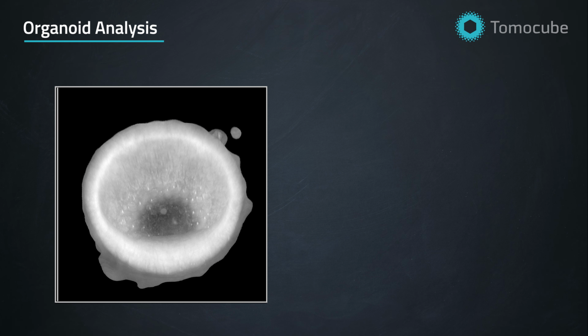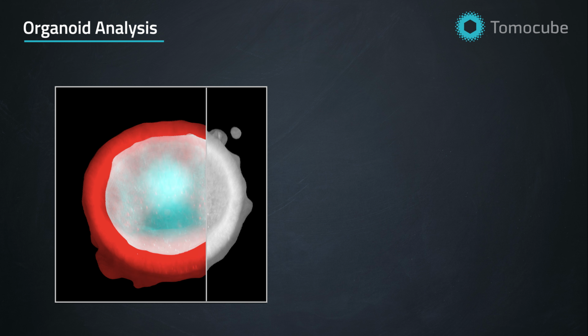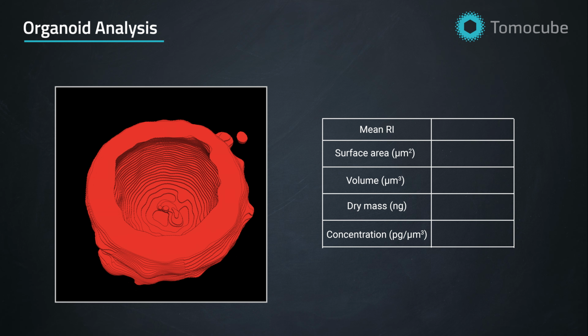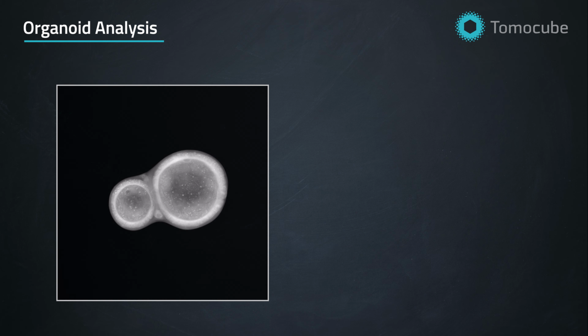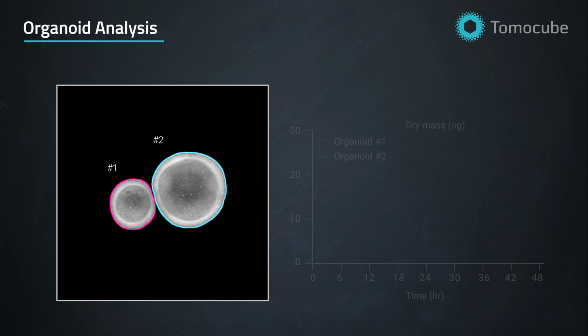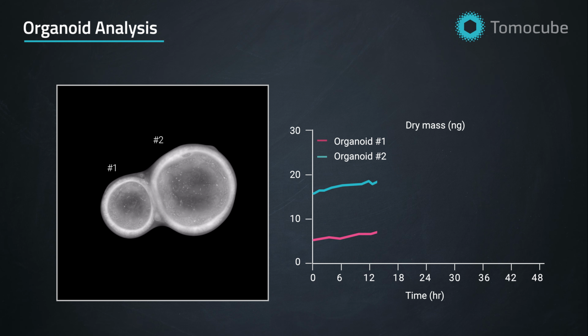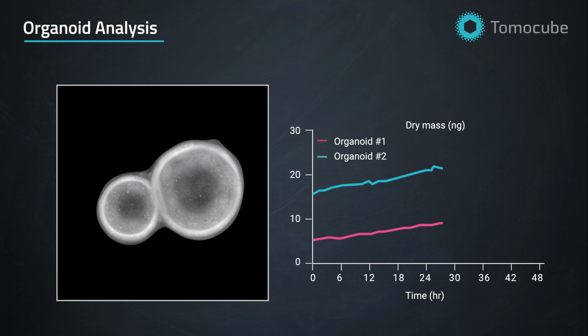Monitor organoid development with confidence. TomoAnalysis provides comprehensive 3D analysis of organoid growth, structure, and condition. From early-stage development to detailed lumen assessment, uncover critical insights for advanced biomedical research.